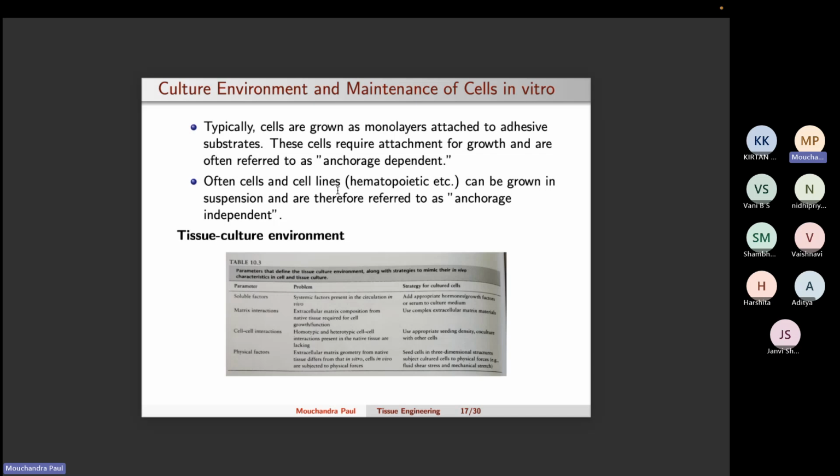Because of this you can create a sterile environment, and all the air that is flowing in the laminar airflow hood is passed through HEPA filters. These filters have a very small pore size, like 0.2 micron, which is going to filter out all the airborne microbes.